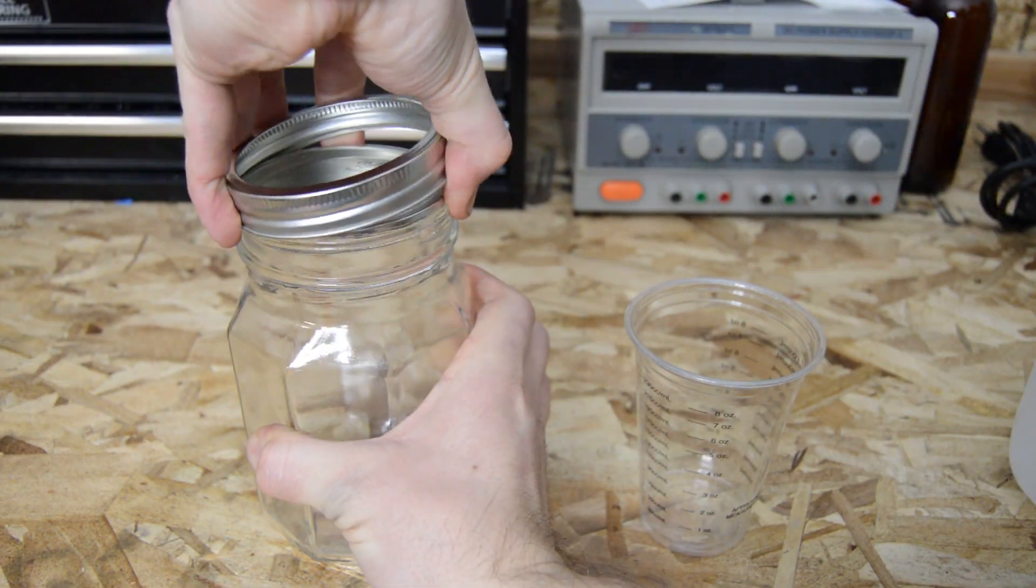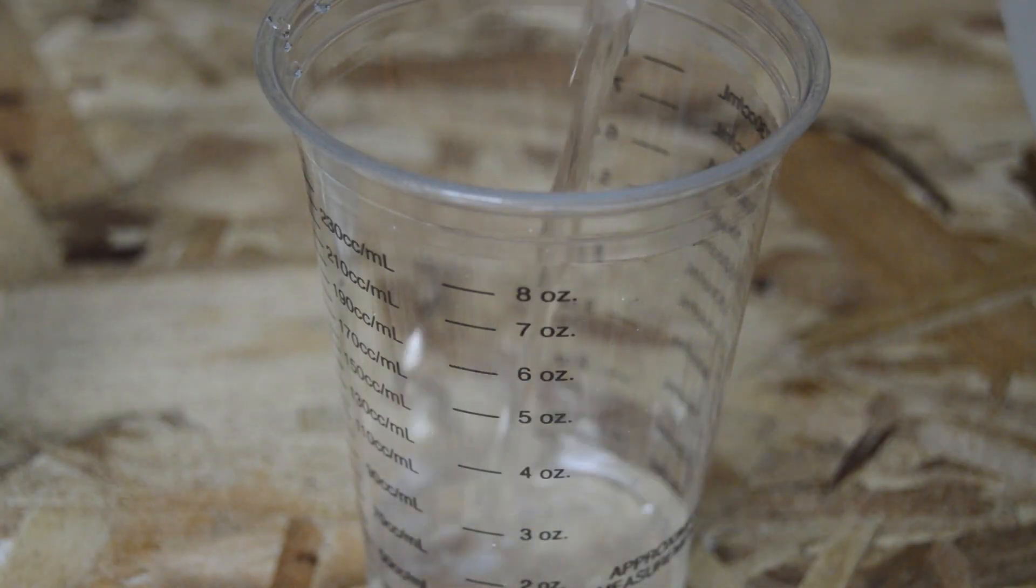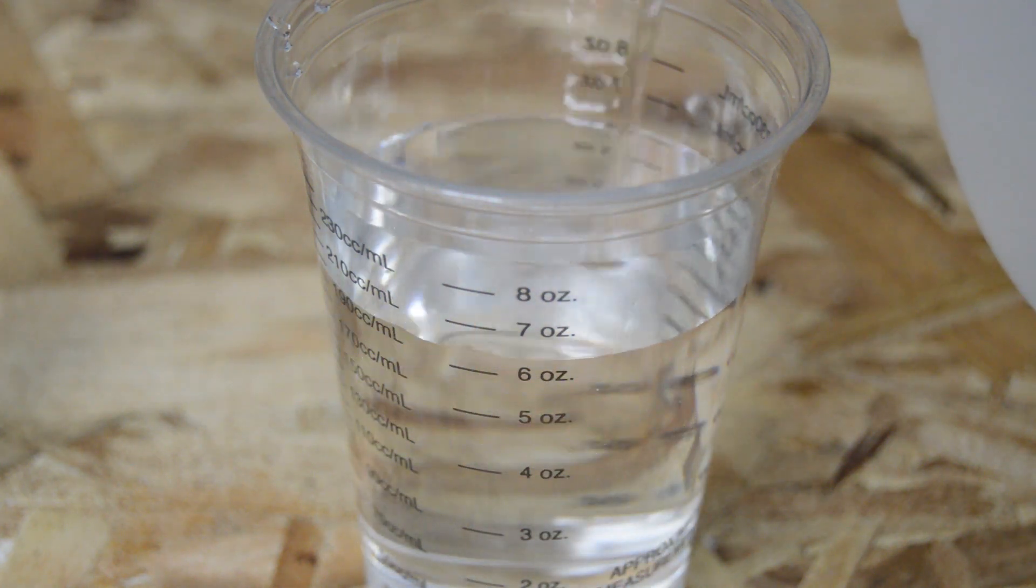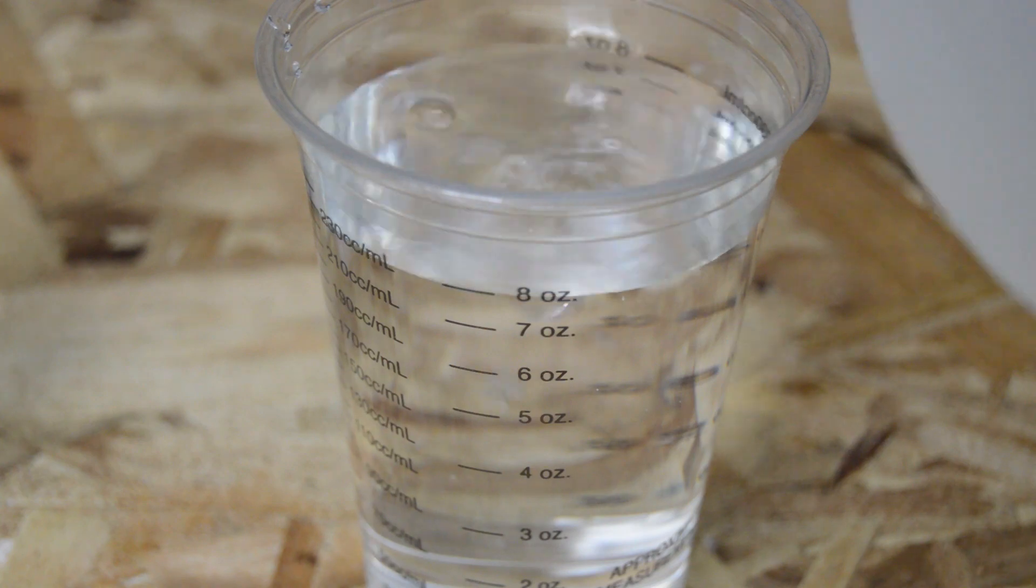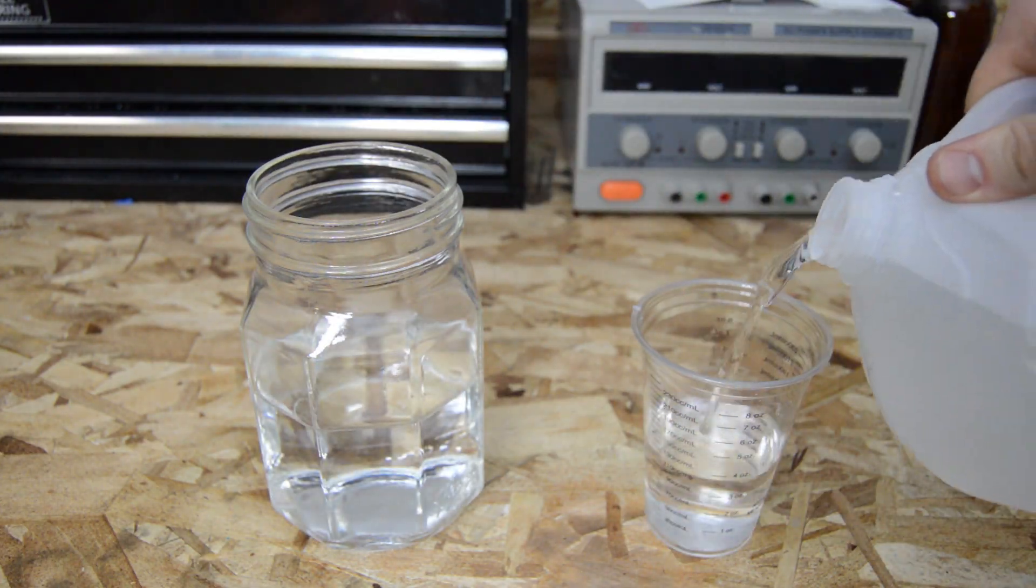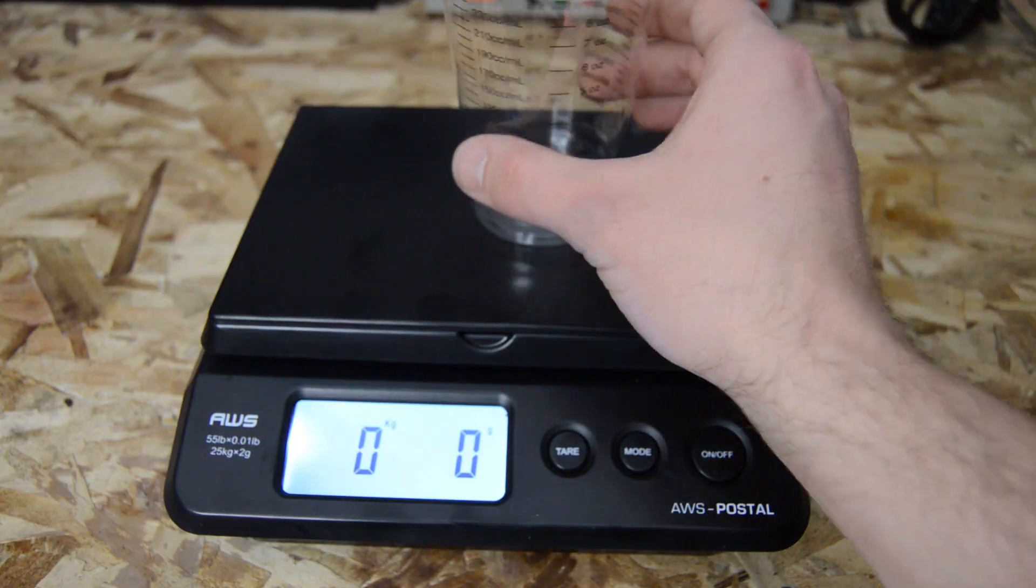Let's get started. We're making a nickel plating solution for what's called a Watts plating bath. Take your Mason jar and a measuring cup and add 24 ounces of distilled water. The reason you want to use distilled water is to minimize the mineral impurities present in tap water and spring water.